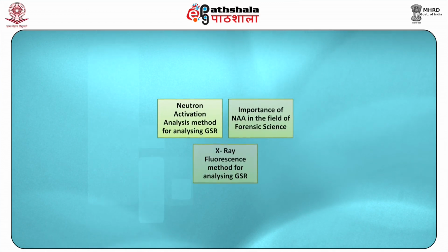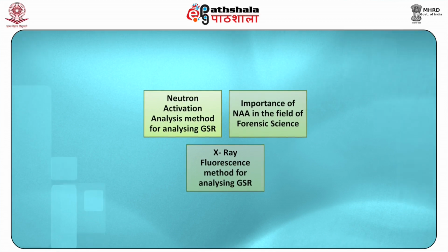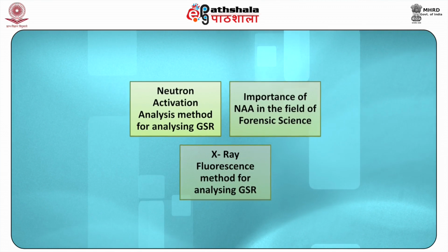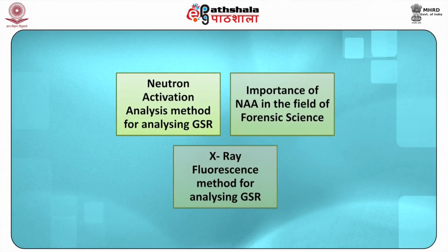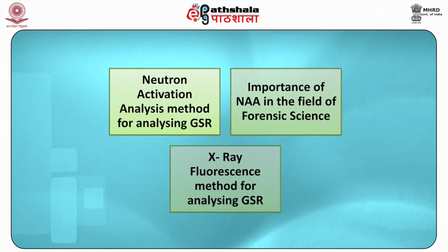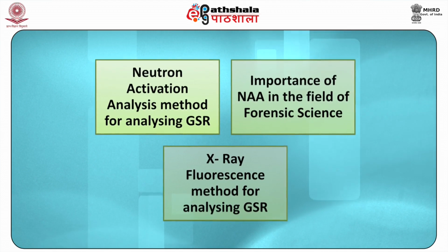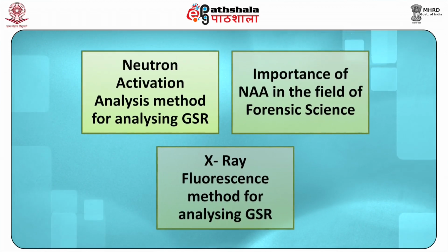After studying this module, you shall be able to know about the neutron activation analysis method for analyzing GSR, about the importance of NAA in the field of forensic science, and about the X-ray fluorescence method for analyzing GSR.